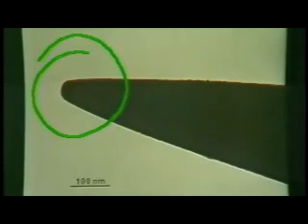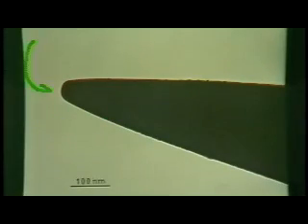So it's possible to create essentially spheres in space, not isolated, but nevertheless spherical contours that are very, very sharp. Now suppose we asked ourselves, what actually does the apex of this metal surface look like if we could look at it with atomic glasses?